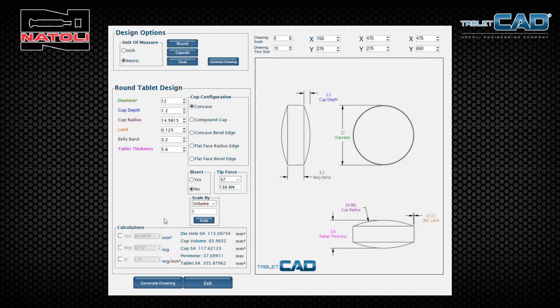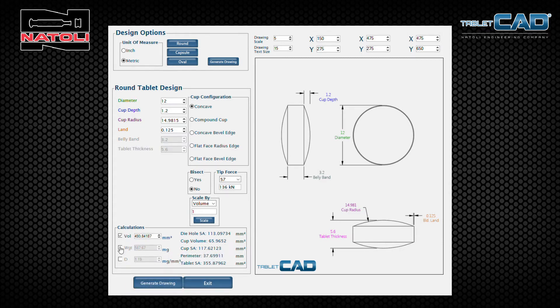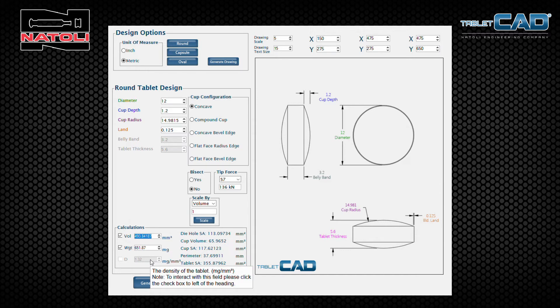At the very bottom of the screen, you have total tablet volume, total tablet weight, and compressed density of your tablet. You can select two of these three values. If you want to know the density of your particular tablet and you've already established a tablet weight of 650 milligrams, put in 650 and notice that the density changes from 1.19 to 1.32 — so this is the density of this particular tablet.